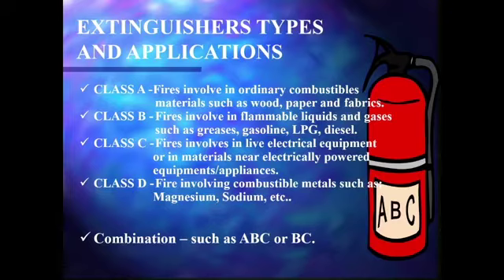Okay, but do not use ABC dry powder fire extinguishers on Class D. It may cause some other chemical reaction. I'm sure in UPM, in all the labs, there are appropriate fire extinguishers installed in probably every lab or building or any specific areas.